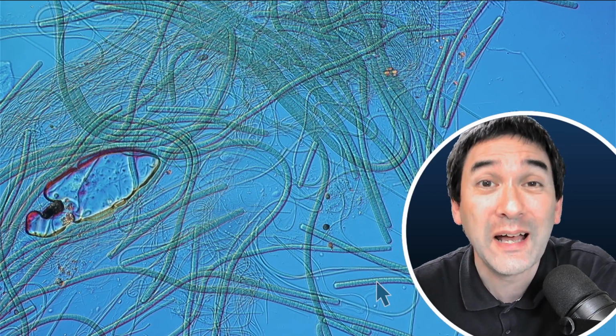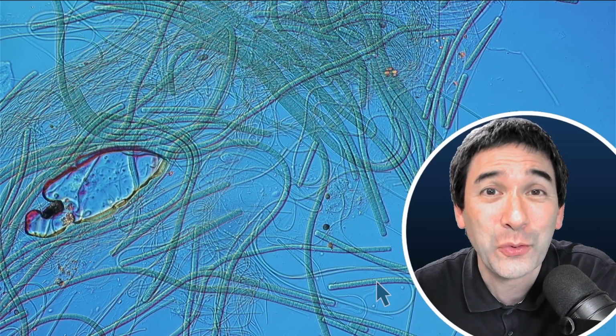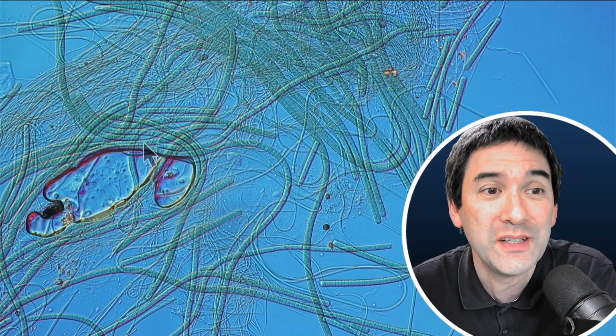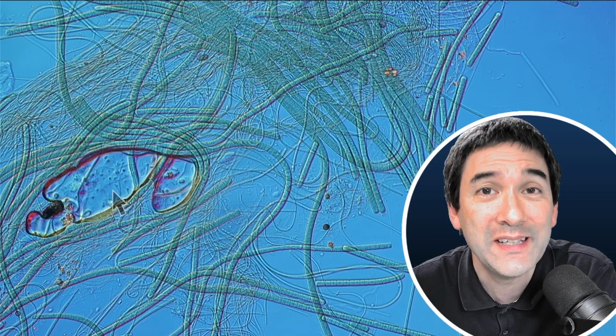They are gliding along the microscope slide, so to say, and in the process, they of course do photosynthesis and produce a significant amount of the world's oxygen. Look over here. Did you just see this bubble over here? Yeah, it's slowly growing. Yeah, that is oxygen, right?